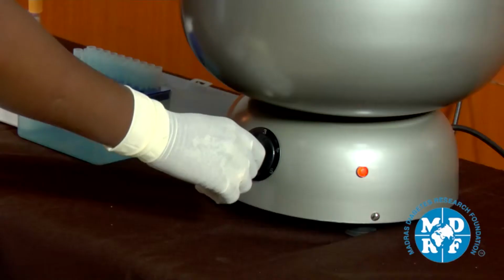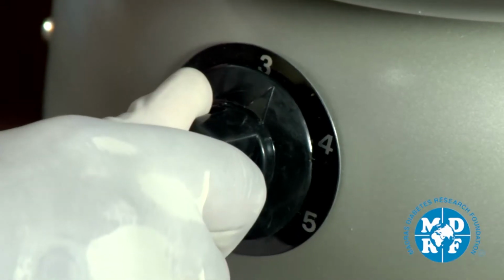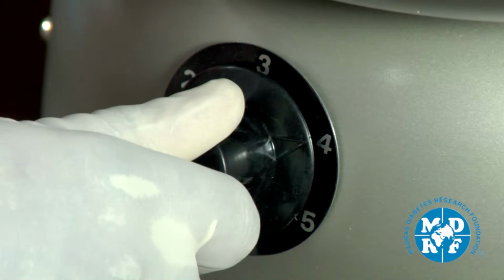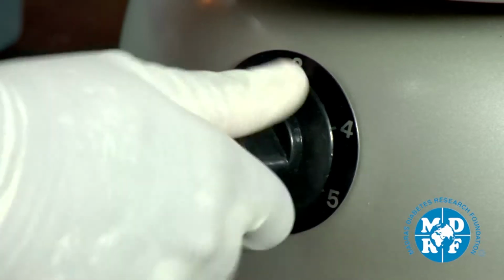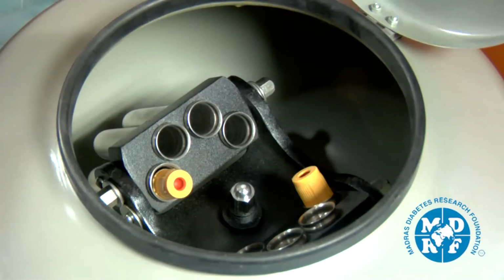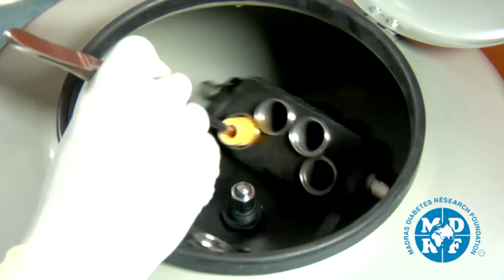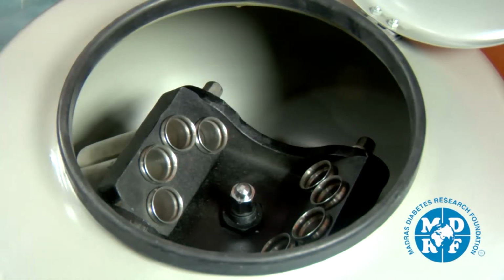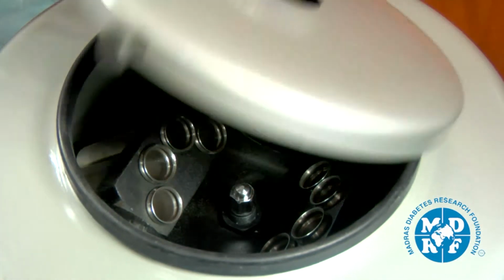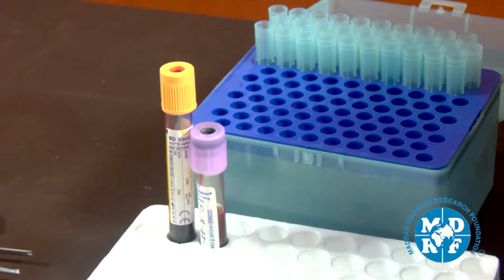Close the lid and begin centrifugation. Gradually increase the speed until 4000 rpm is achieved. Centrifuge the samples for 10 minutes at 4000 rpm. On completion of the runtime, gradually decrease the speed and bring it to 0, then switch the machine off. Make sure that the rotors come completely to the rest position at the end of the run before opening the lid of the chamber. Remove all the vacutainer tubes from the centrifuge using the forceps without disturbing the sample in the vacutainer. Place the sample tubes on the thermocol tube rack.